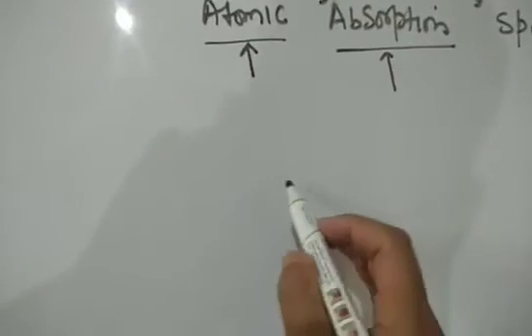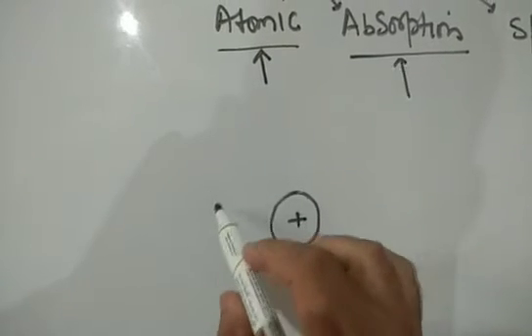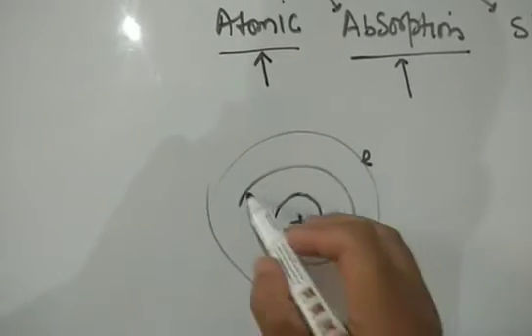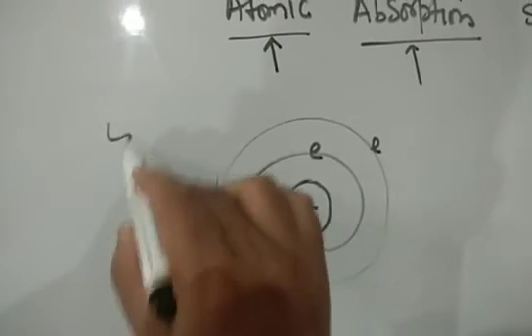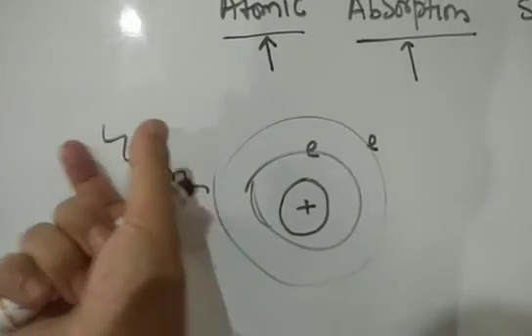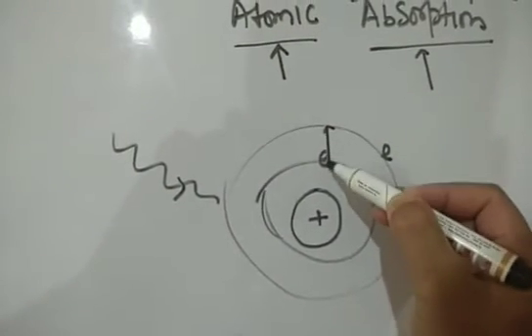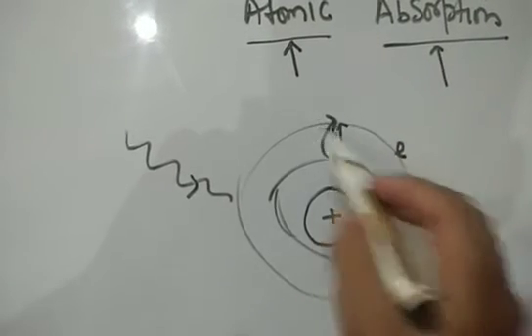और absorption के दौरान now अगर हमारे पास एक atom है, theoretically we have a nuclear part and then we have extra nuclear part where we have electrons present, roughly. So when the radiation interacts with your atoms, अगर उस रेडिएशन में appropriate एक wavelength हो जिसकी energy matches the energy difference between the two energy levels, so the electron gets excited from this to this.